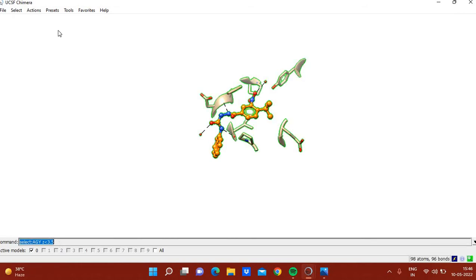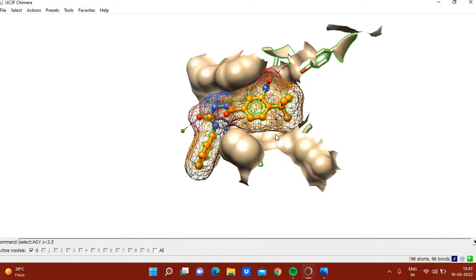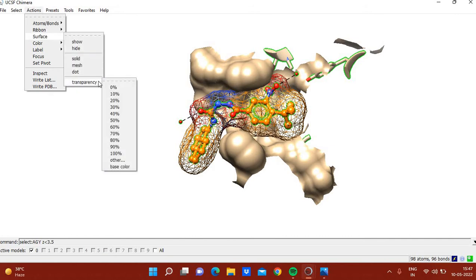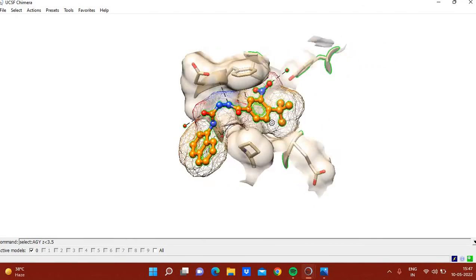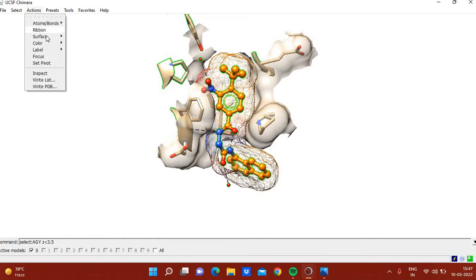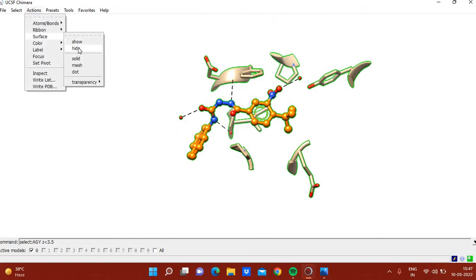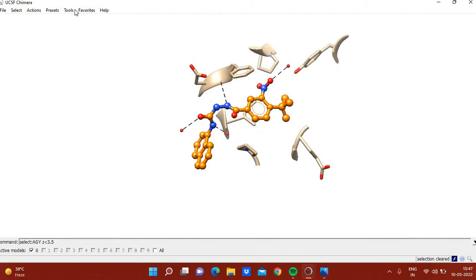If you want to show surfaces together, that is also a nice representation. You can change the transparency of the surfaces to get a combined view. Clear the selection when done. The important thing is to label the residues.